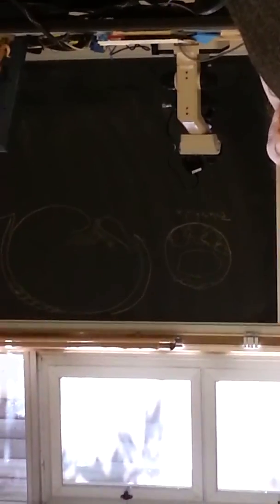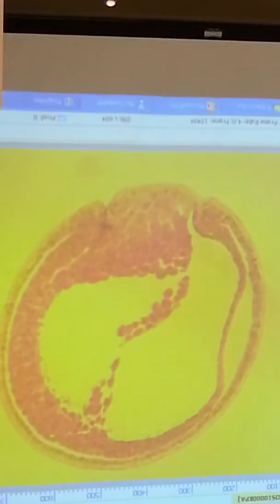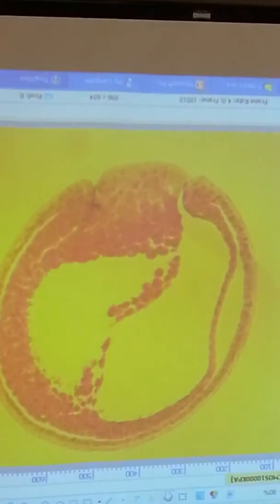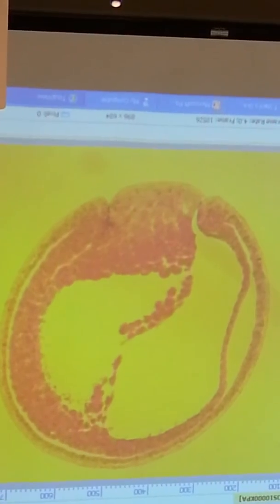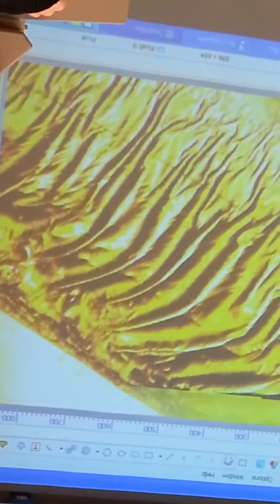Now soon the archenteron, and in fact I think I'm kind of getting faked out. I think most of what I'm seeing in here is archenteron and the blastocele is being pushed out. Some of you will see a nice clean blastocele on your gastrula. Some of you will maybe be seeing some of the archenteron already.